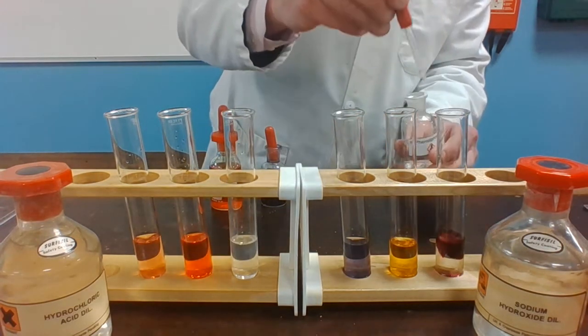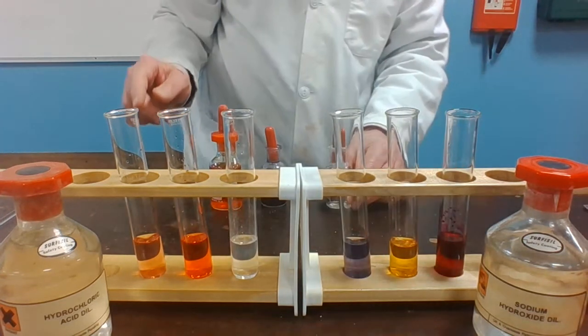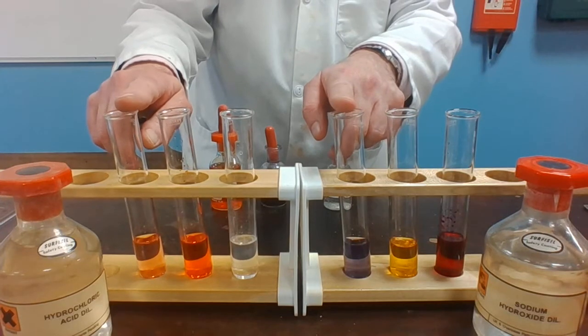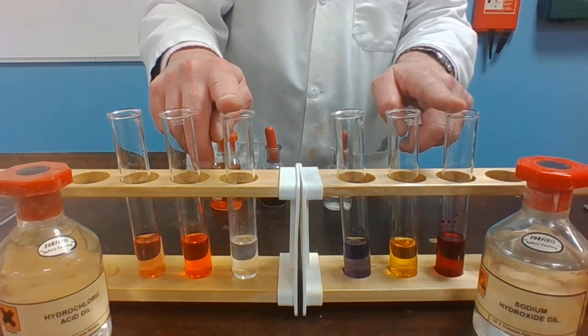Add phenolphthalein to the alkali and we get a pink color. So that is litmus, methyl orange, and phenolphthalein.